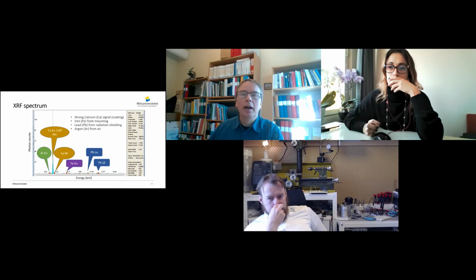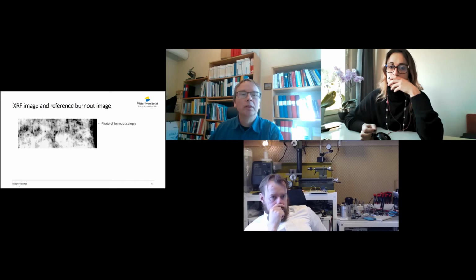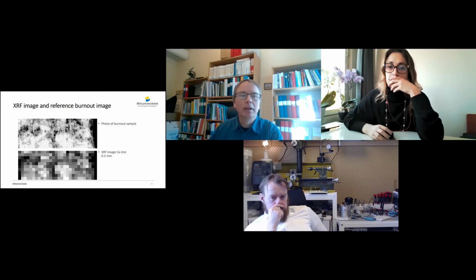In this study, we looked at a reference image taken with the common chemical burnout process, and we compared that to an XRF image with quite wide steps, 0.5 millimeter.